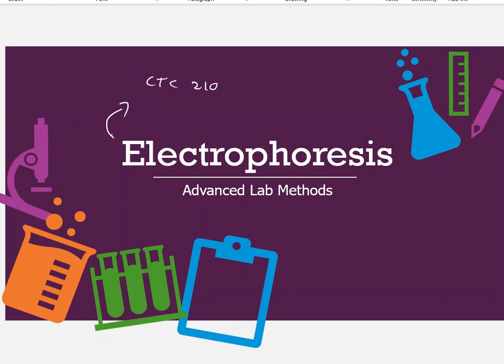All of the sample prep for the extractions that are taken, the samples that are processed, and everything else that goes on with it leading up to the electrophoresis, we focus with that in CTC 210. Now, I will say, though, a little bit of this lecture that you're going to get with me in this course is going to focus on some small tidbits of information as far as samples go and what does go on, but by no means is it anything detailed. And you're going to get those details later on in a different course.